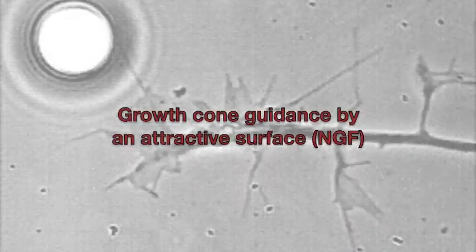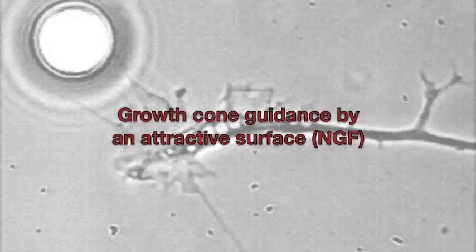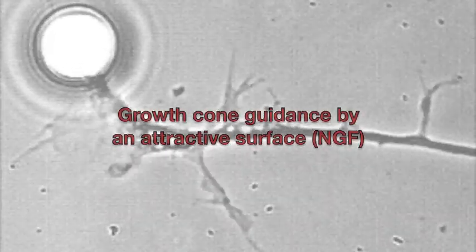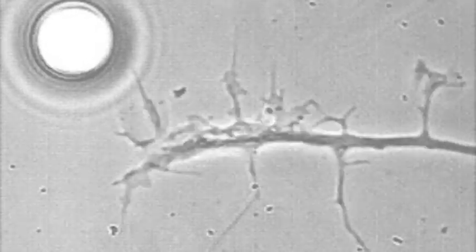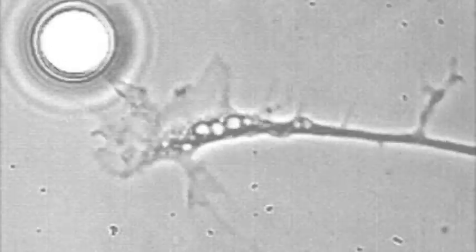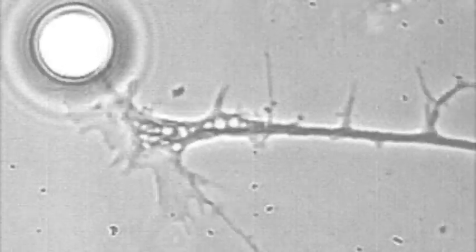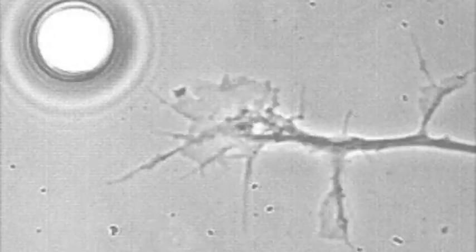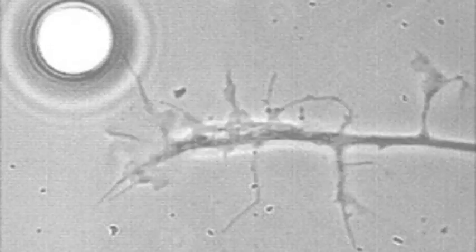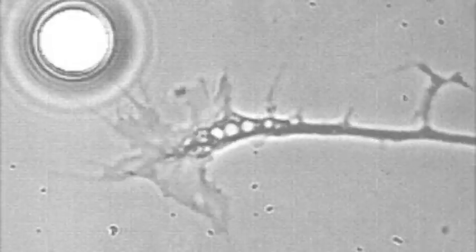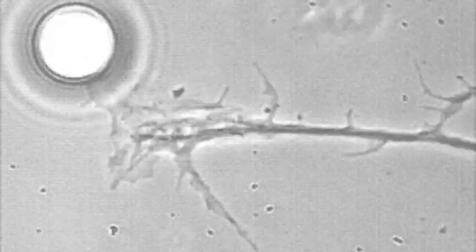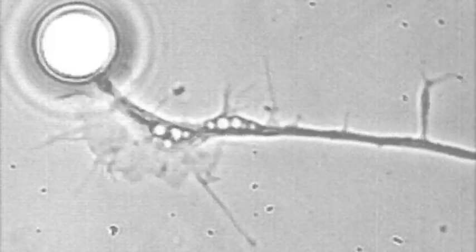In this movie, a sensorineuronal growth cone turns towards a small NGF-coated bead. Filopodial contacts with the bead first stabilize and expand, then microtubules and organelles rapidly flow forward towards the contact point.